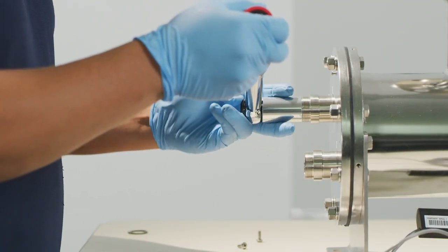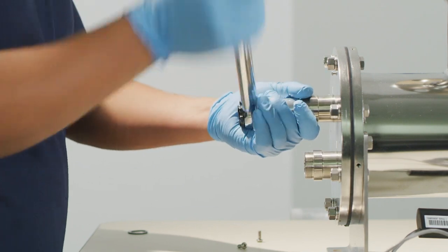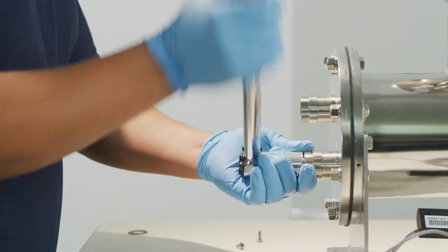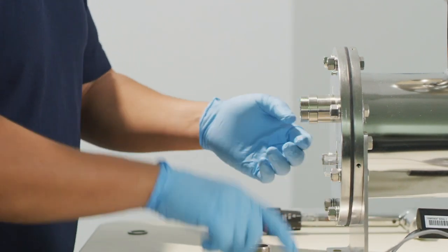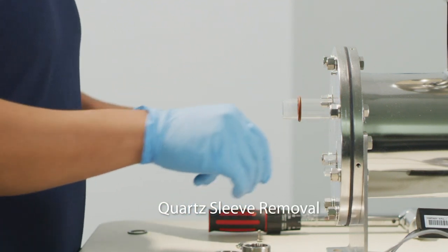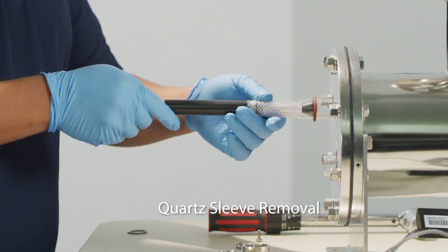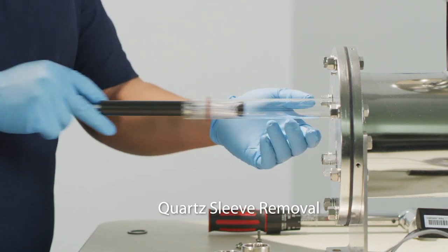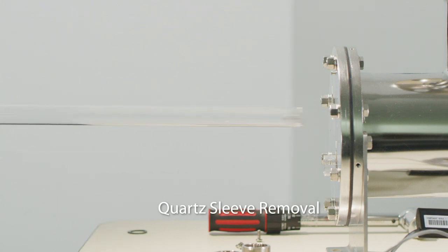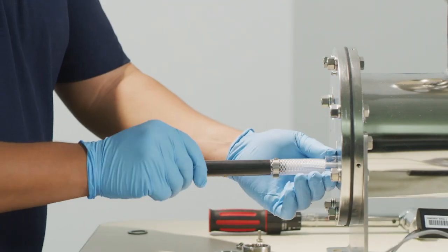Take out sleeve bolts completely to expose the quartz sleeve for removal. Repeat process as needed. The quartz sleeve may be stuck due to its time in a fixed position. Use the quartz sleeve removal tool to free the sleeve from the unit. As each quartz sleeve is removed, tilt the open end downward to the ground to allow the internal tension spring to be removed and replaced during service.